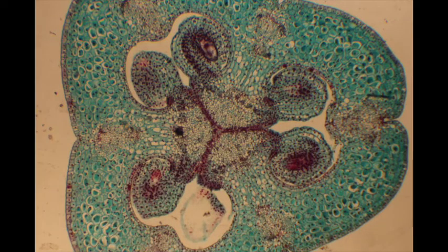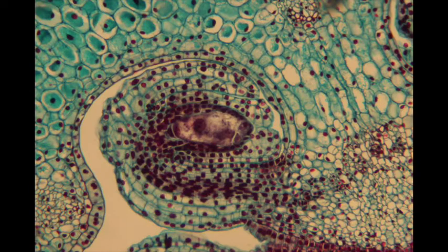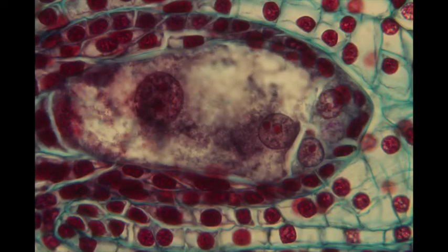Okay, so now we're under the compound scope. This is the 4x objective, 40x magnification. We'll switch in the 10x. Okay, so here's our 10x, so we have 100x total magnification. Now we'll switch in the 40x. Okay, and here is our 40x objective.